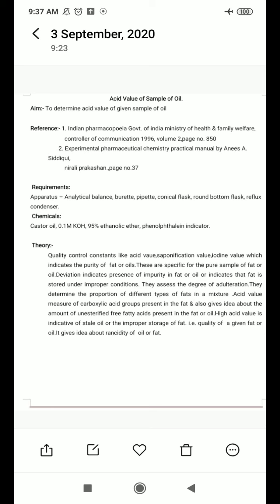Because in that storage condition your sample remains pure and does not lose its purity. If we deviate from that storage condition, your sample gets degraded or impurities get generated.